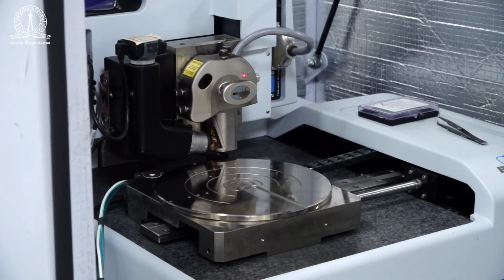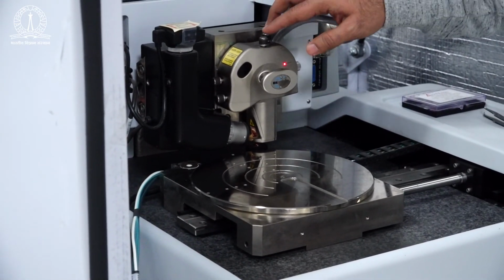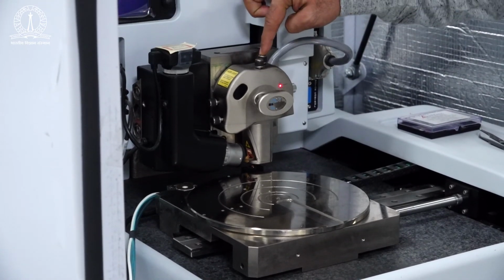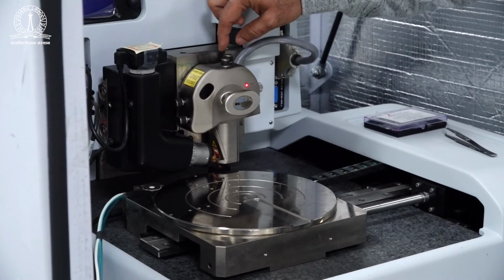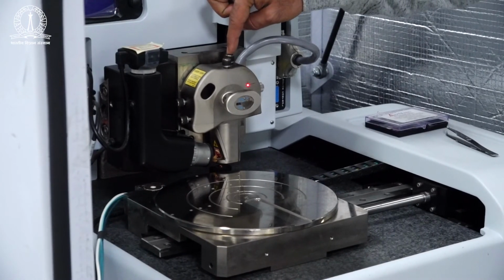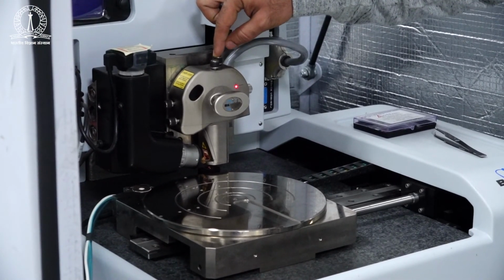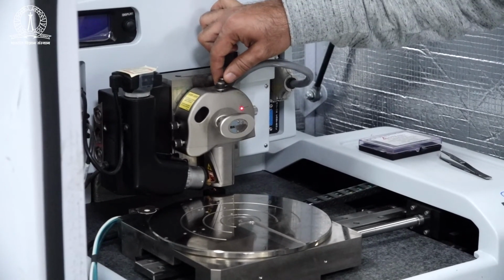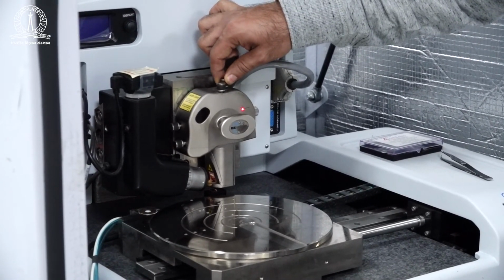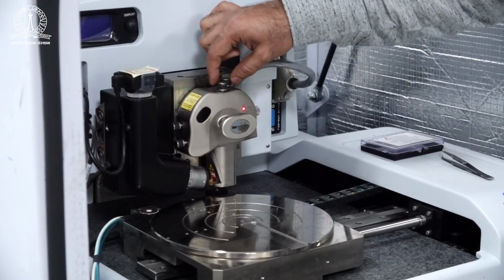As you can see on the screen, the laser is not visible over there. To bring the laser onto the cantilever, there are two knobs here. This is for the X movement and this is for the Y movement of the laser on the screen. Initially, we rotate this laser knob in an anti-clockwise movement. Again, remember, this should be done in counterclockwise movement, so that the laser comes out to the left and comes out on the screen, and we can see it now.